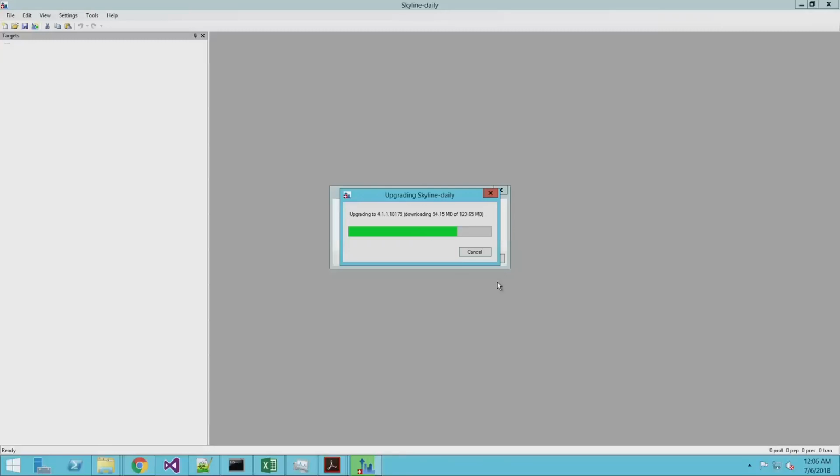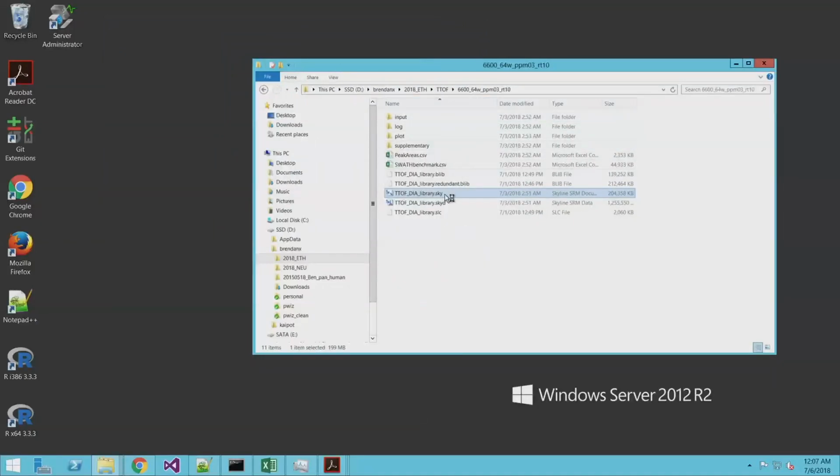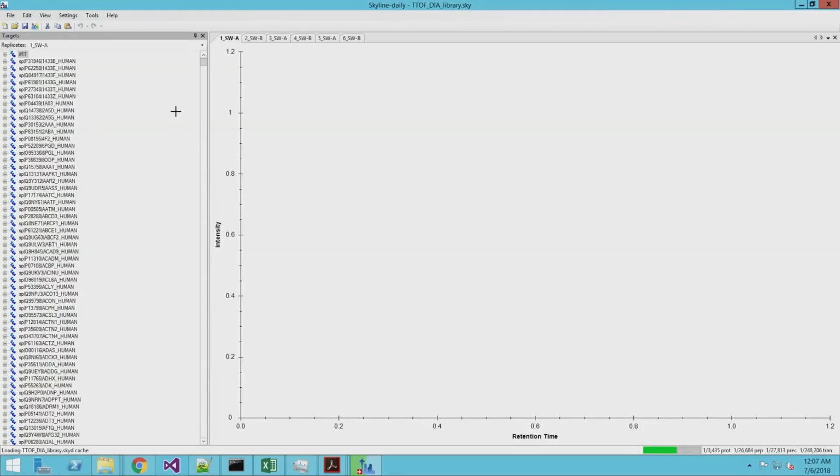And if I mentioned AutoQC, we run something on all of our instruments that's uploading files to Panorama, and then you get those longitudinal plots that I showed the first day. But similarly, it's just running the Skyline command line, and it leaves the Skyline file around so that you can look at that Skyline file. A lot of people in our lab, when they're in the lab, they're not looking at Panorama. They're looking at Skyline documents sitting on the instrument PCs, and they feel like that's a quicker way to get a sense of what's going on.